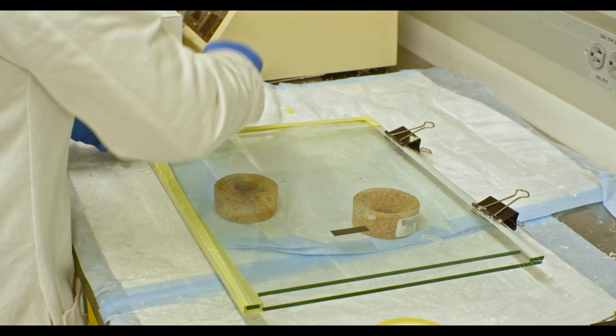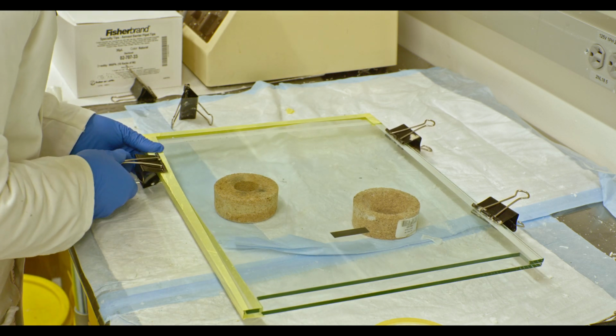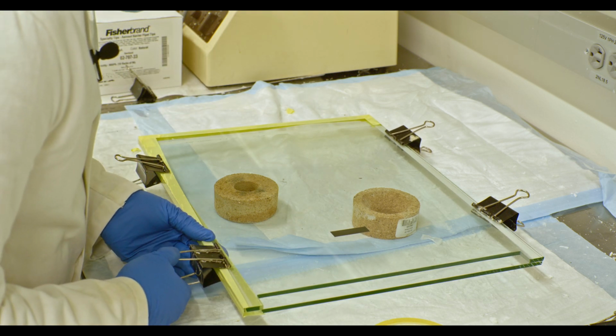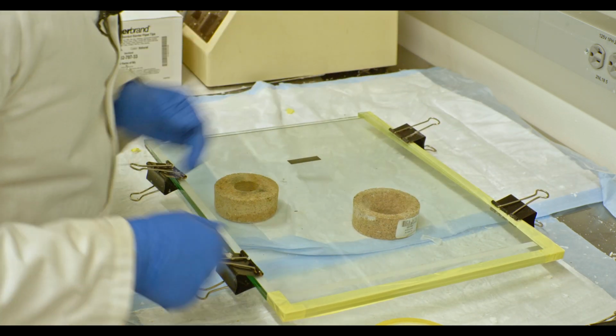Okay. Then after putting on the tape, make sure to put the clamps back on just to help with the immobilization. And then you rinse and repeat on the other side now.